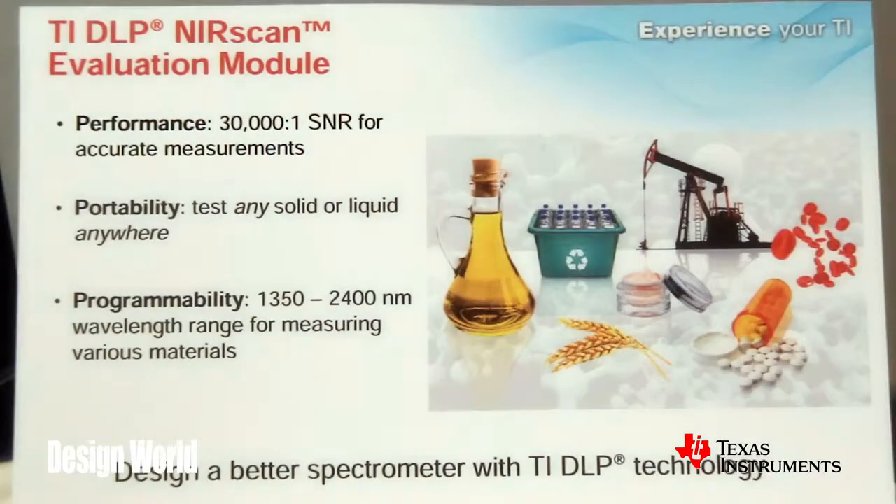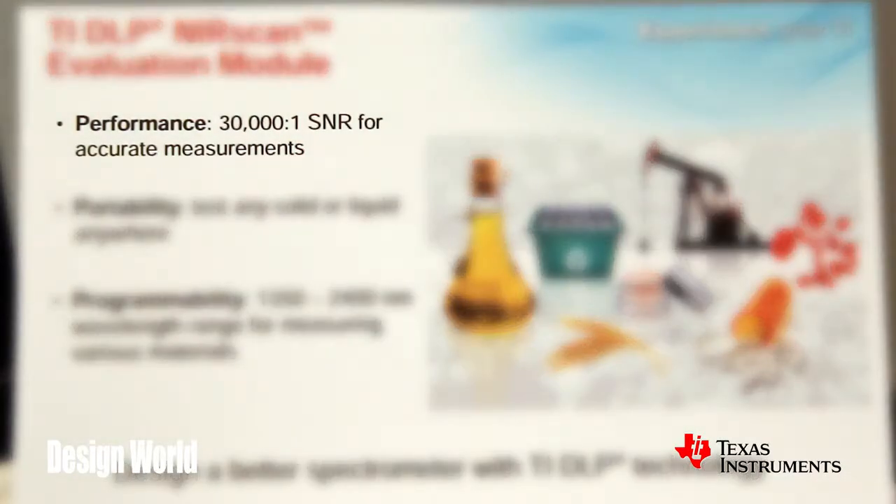One of the questions design engineers might have about this is the degree to which you can resolve a signal. Our customers have the flexibility to design a system and make a lot of trade-offs based on their requirements. This particular evaluation module has been tested to a 30,000 to 1 signal-to-noise ratio, which competes with off-the-shelf systems that can range in the $20,000 mark.